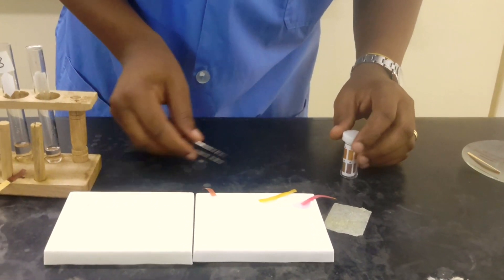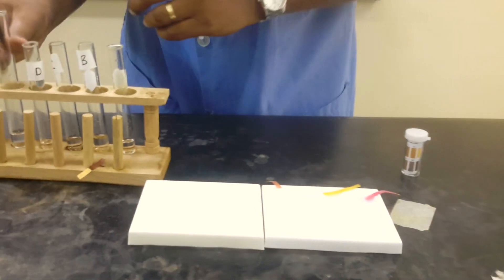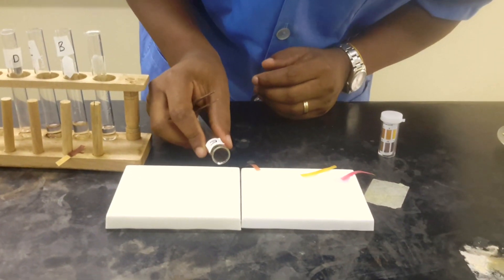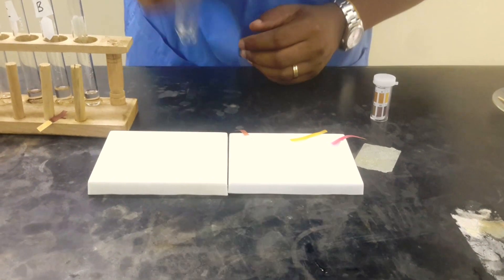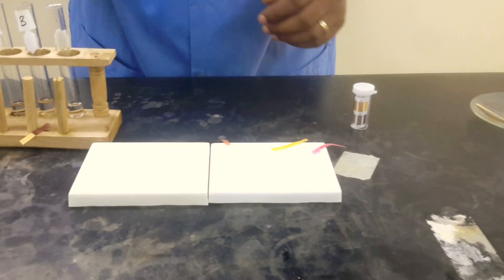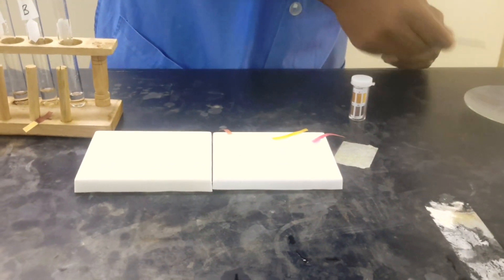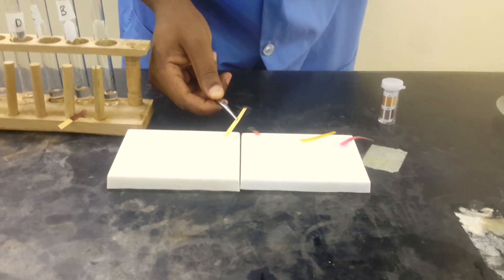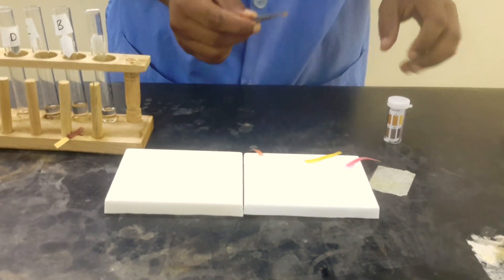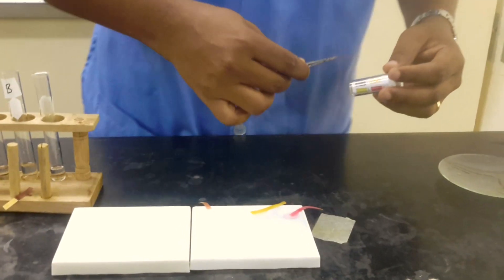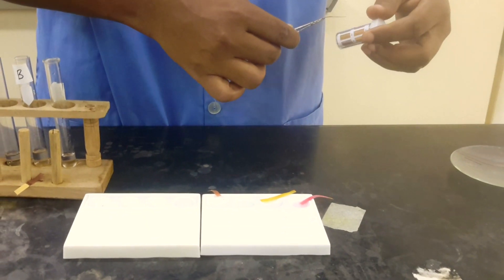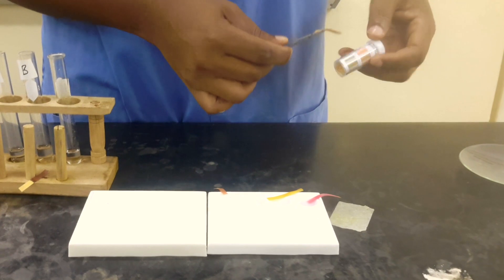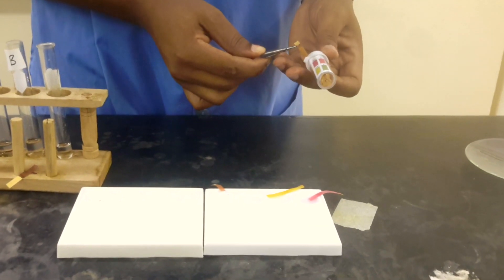We'll do the same thing for the last one. So we pour a small amount of E. I'm not going to touch it. So as the color changes, we will just go right away and find which color this matches.